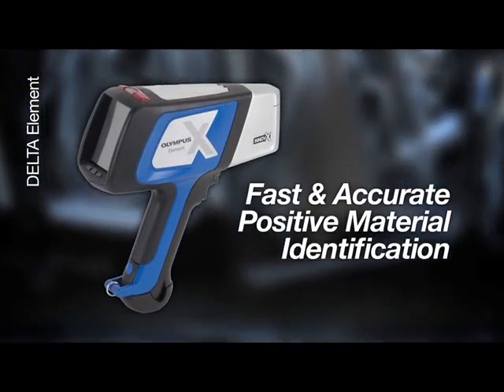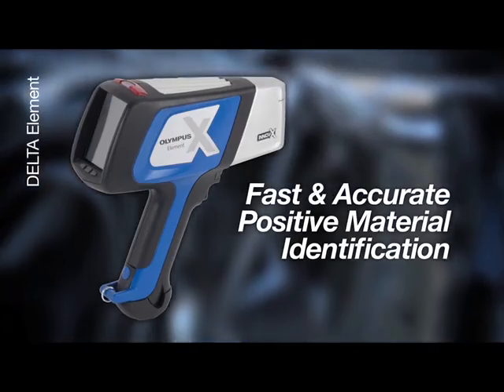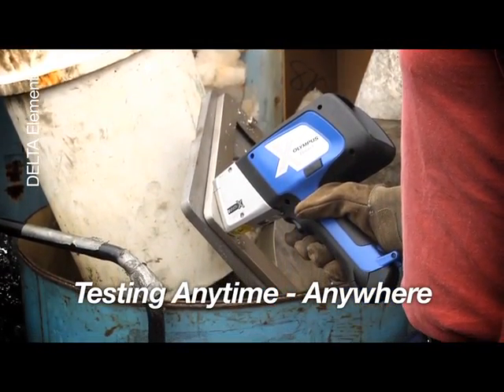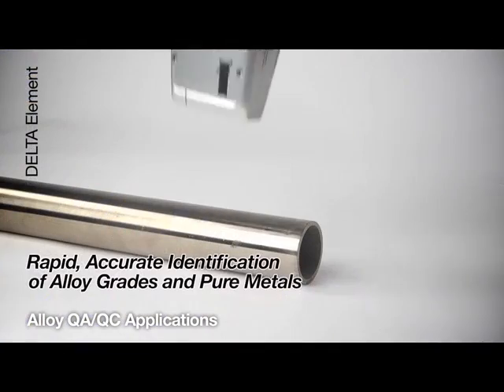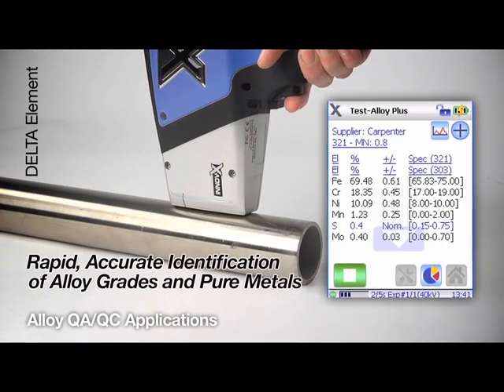When reliable material analysis is required, the Delta Element provides fast and accurate positive material identification. The Element allows testing anytime, anywhere. For alloy QAQC applications, the Element rapidly and accurately identifies alloy grades and pure metals for quality control and assurance.